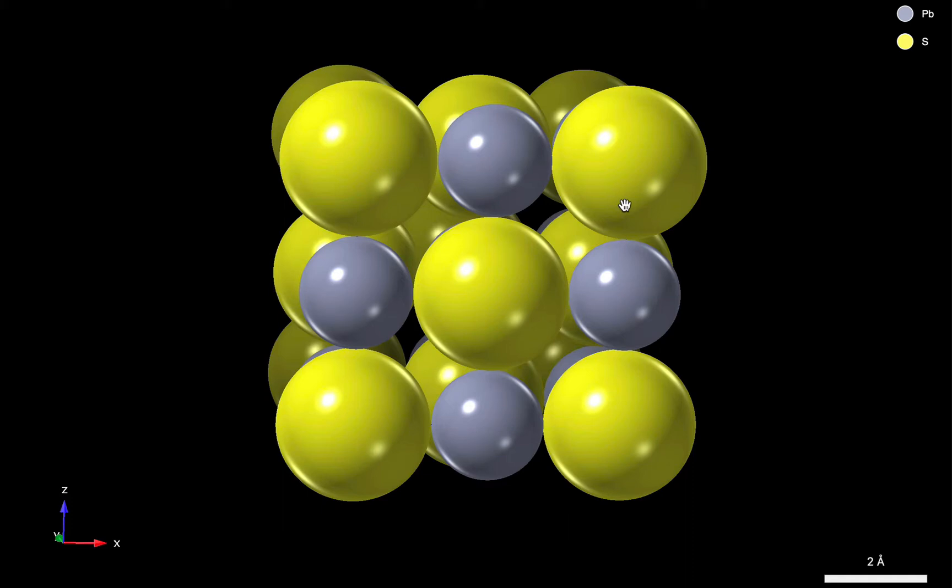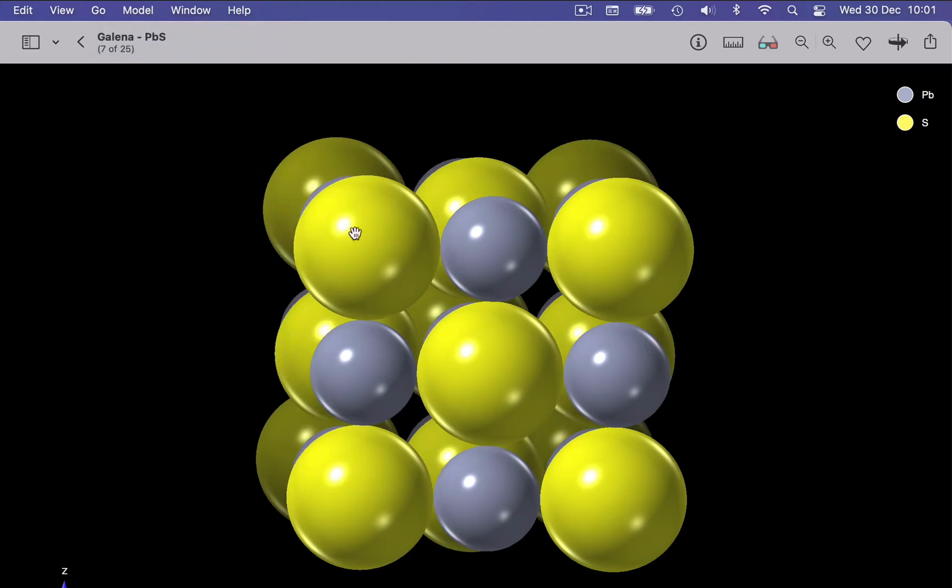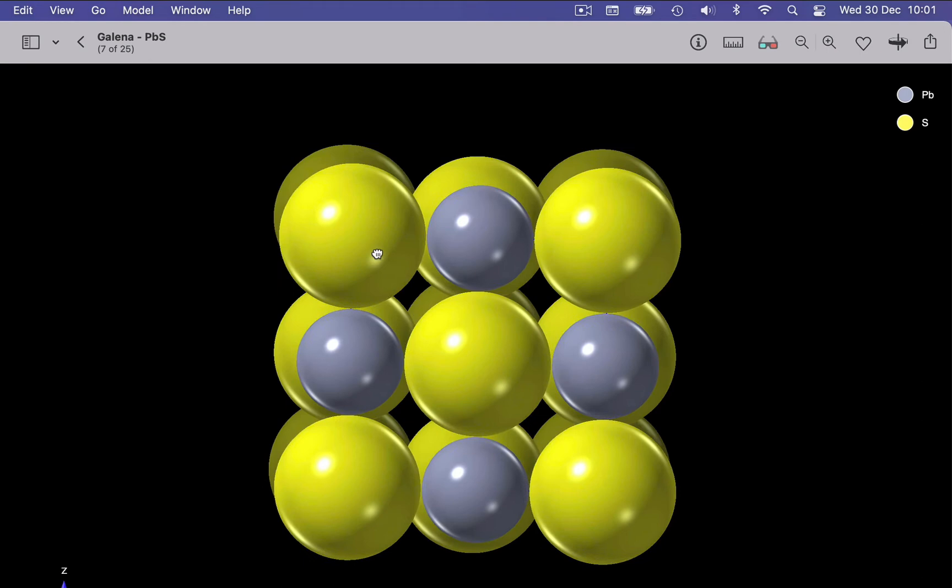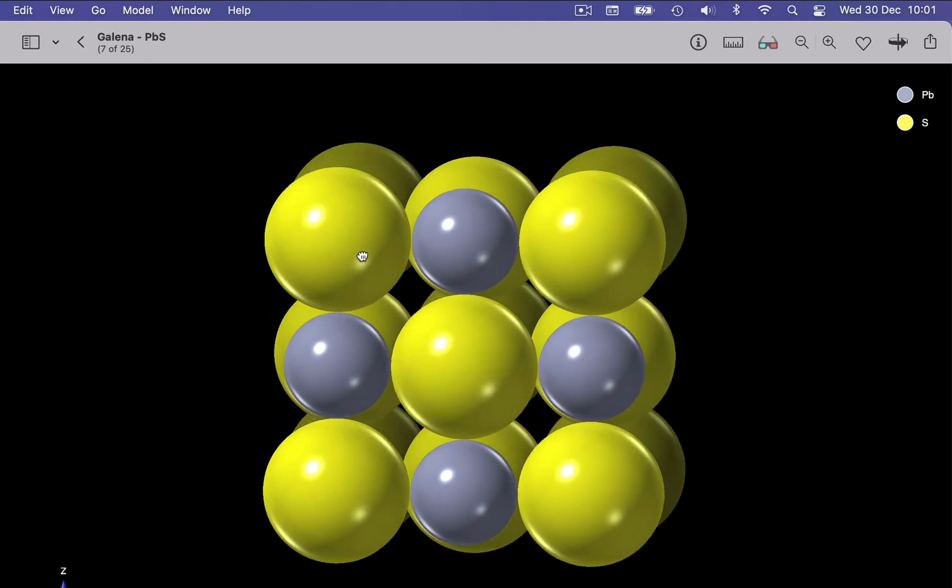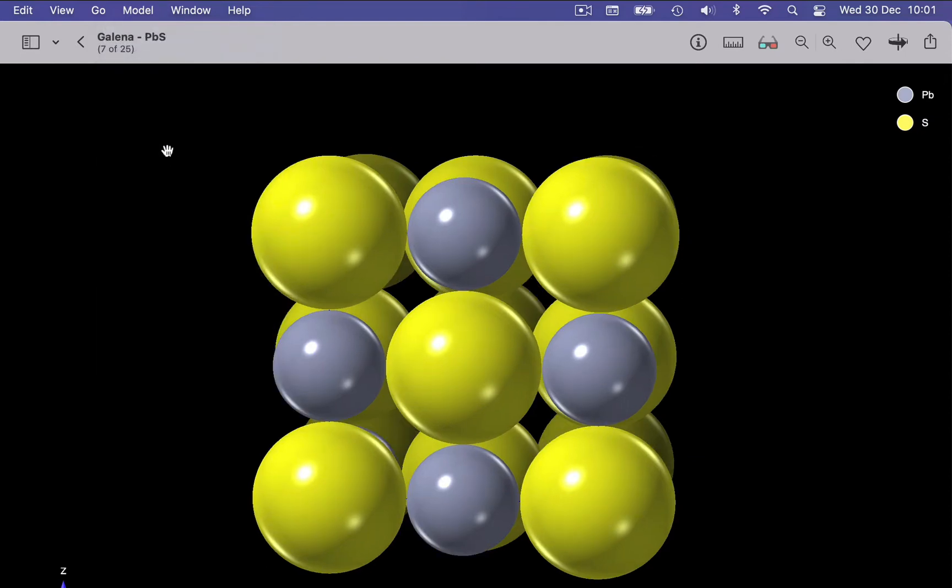You can toggle this on or off using the Model menu. Model. To turn perspective off, we choose an orthographic view. Now the back atoms are the same size as the foreground atoms. Good for measurement, but maybe not quite so good for visualisation. Let's go back to our perspective view.